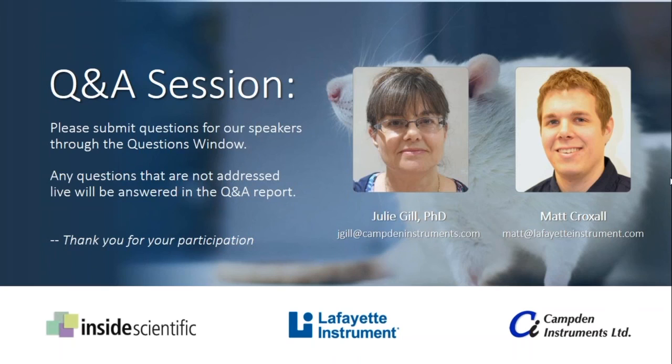But we also provide training as well, so people can come to us for additional training on how to program the system if they want a fast track rather than reading through the manual. And many of these pre-canned tasks come with some common manipulations to increase or decrease difficulty of the task. Yeah, a lot of those can be changed just at the execution manager stage as well, so you can change them just prior to running the task, as well as going in and changing them in the task itself. Okay, perfect.